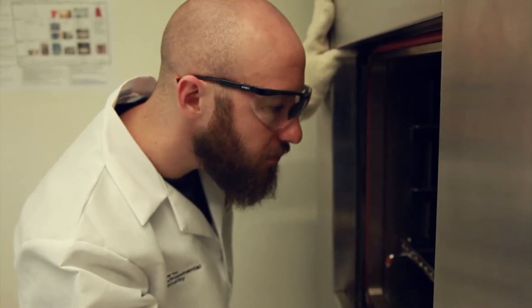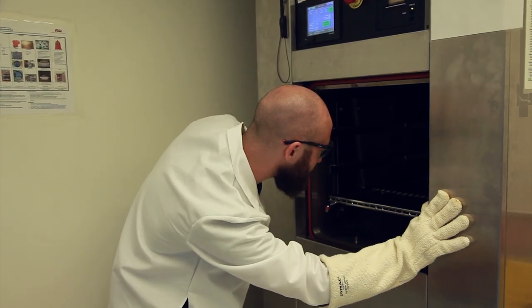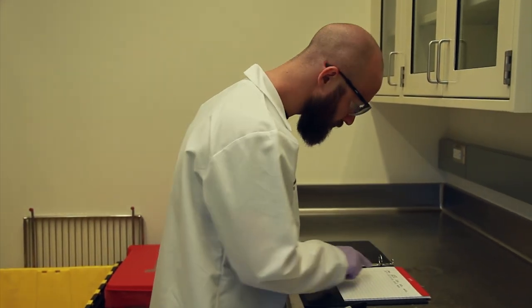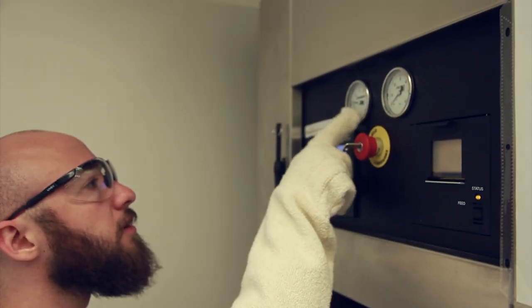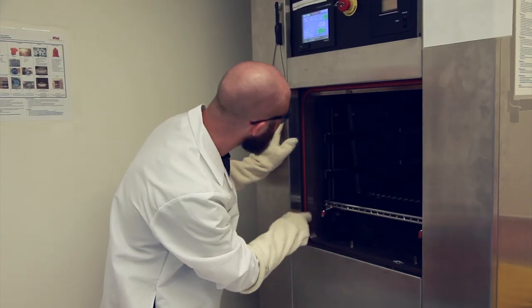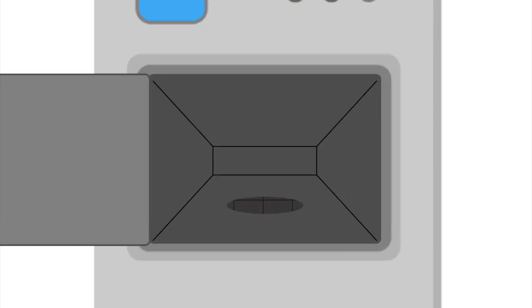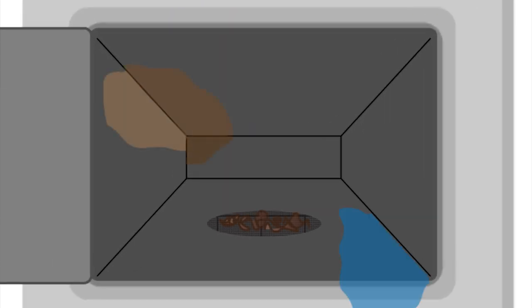Two, ensure the autoclave is okay to use by making sure the inside of the autoclave is empty and clear of spills, by checking the drain and making sure it is not clogged, by looking at the most recent entry in the autoclave logbook to make sure there are no errors that have been reported. If there is a receipt printout with the autoclave, make sure there is enough paper for your autoclave run. Ensure that the jacket pressure has the correct readings. Make sure seals and gaskets around the door are secure and intact. If the autoclave is full, contact the last person on the log. If the autoclave is dirty, has a spill, or needs the drain cleared, contact the lab supervisor and make sure the autoclave is cleaned before use.